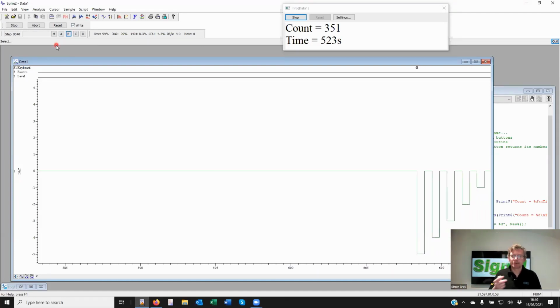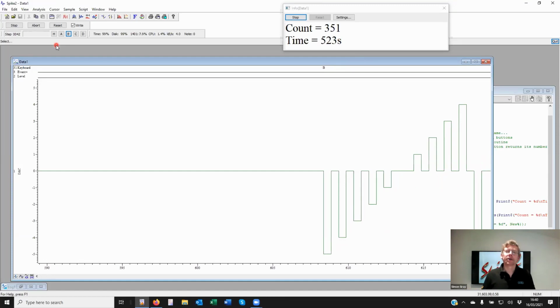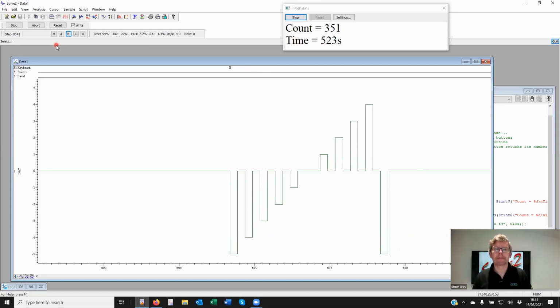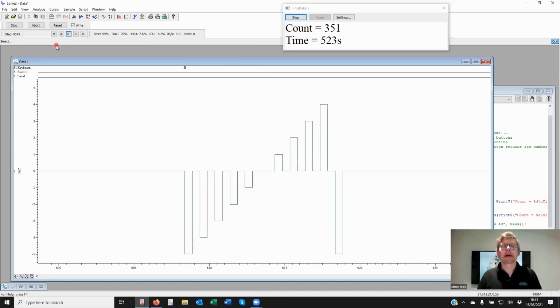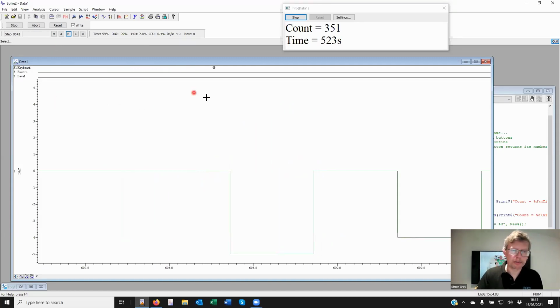Now we see every time the section loops around, we will get a different output. Once again, we could add markers to, say, the leading edge of those pulses. We could add a marker just to say that it actually fired, because when I press B, that takes time to get to the 1401. That is not the time that we started that section, so it could be delayed by a few milliseconds. To have an accurate marker to say this is actually the beginning of the section would be useful, and certainly to label, as it were, the pulses going out.